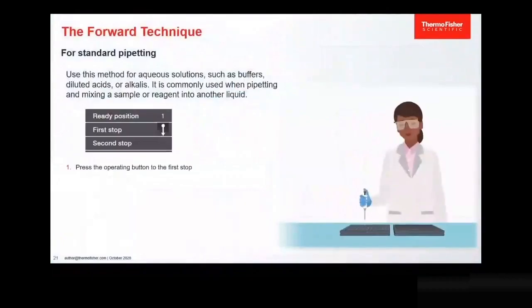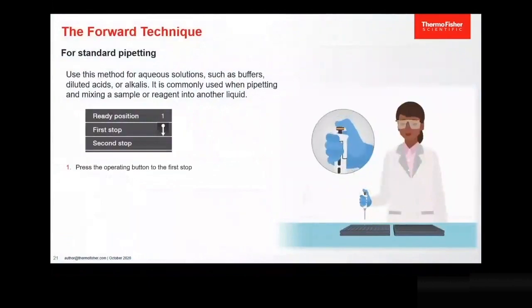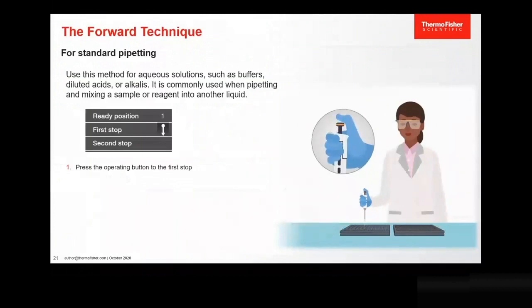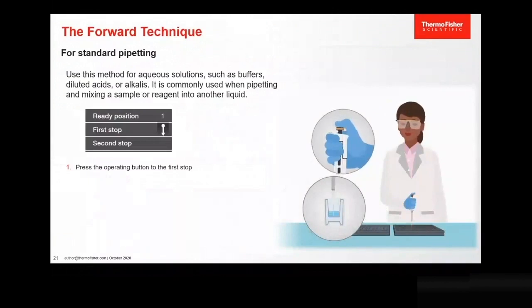The forward pipetting technique. This is the most commonly used pipetting technique for standard pipetting. Use this method for aqueous solutions such as buffers, diluted acids or alkalis. It is commonly used when pipetting and mixing a sample or reagent into another liquid.